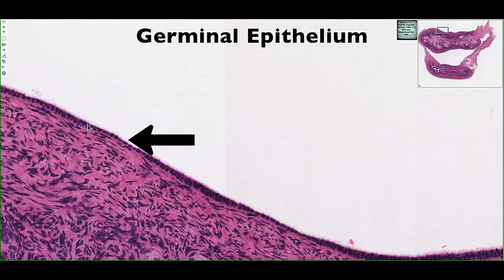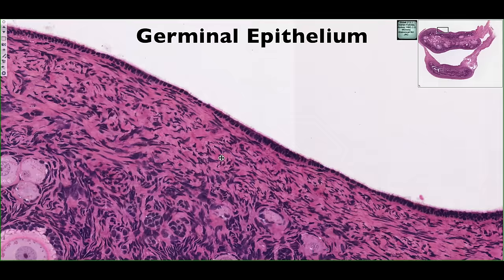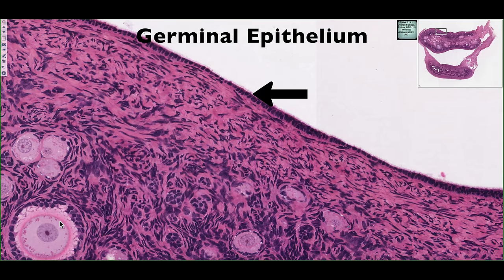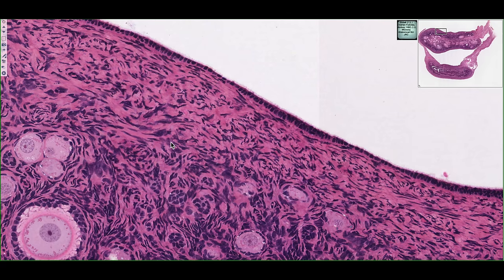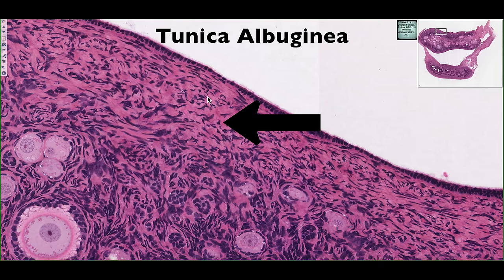This is our germinal epithelium, and it gets its name from early histologists who thought the germ cells — essentially the oocytes — were derived from this cell layer. But this is actually not the case. We know that the germinal epithelium is essentially our peritoneum that is continuous with the broad ligament. The mesovarium is continuous with this layer of cells because it covers the entire surface of the ovary. And just deep to the germinal epithelium, we'll see a layer of dense irregular connective tissue — this is the tunica albuginea, similar to what we saw in the male testes.